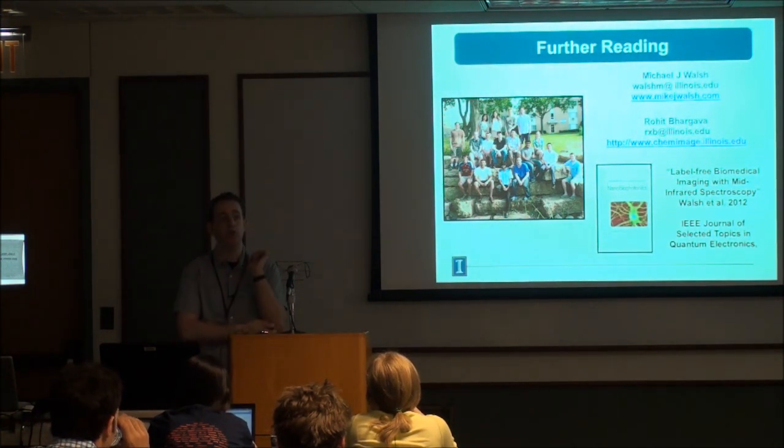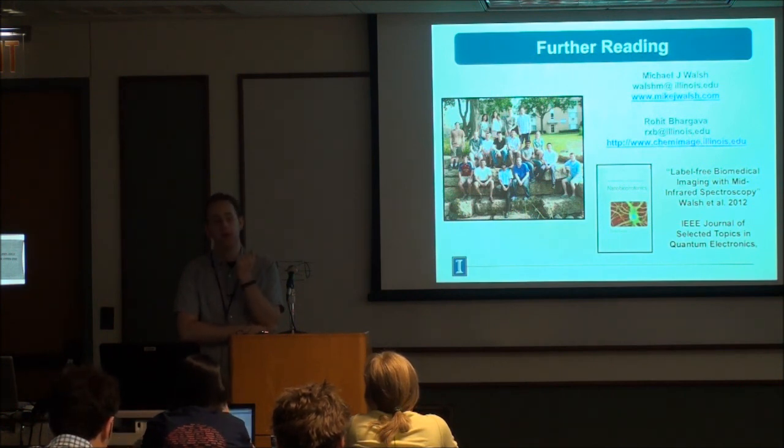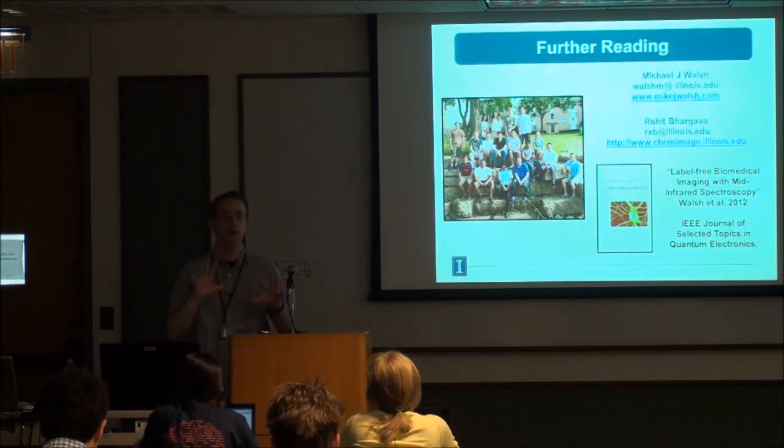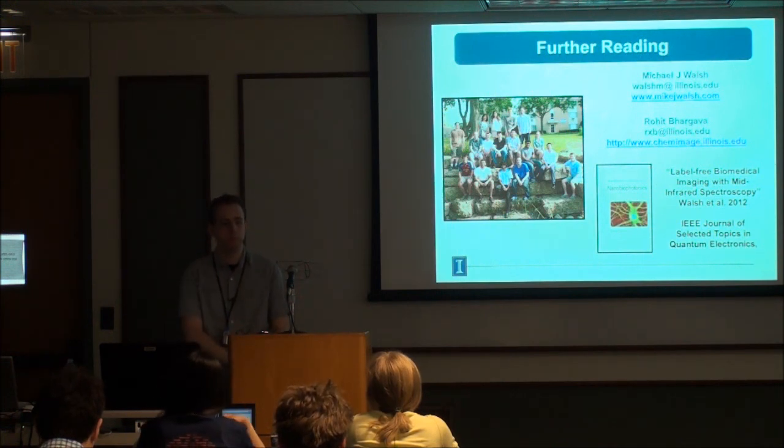Yeah, we use it for most of the scattering stuff, baselining, normalizing, we'll do in ENVI. A little bit we'll do on the PerkinElmer software, like atmospheric correction. We do have a lot of MATLAB code as well. So yeah.